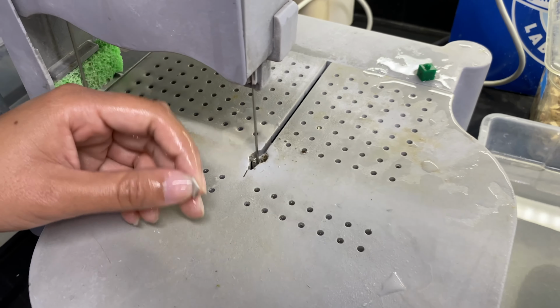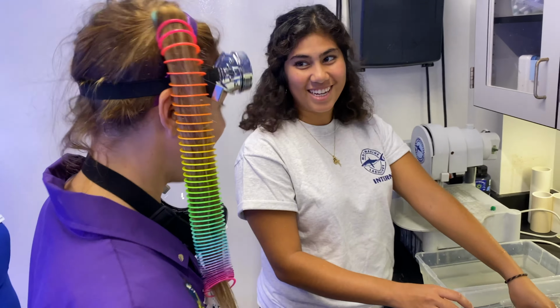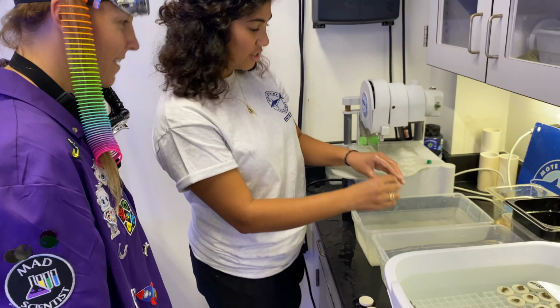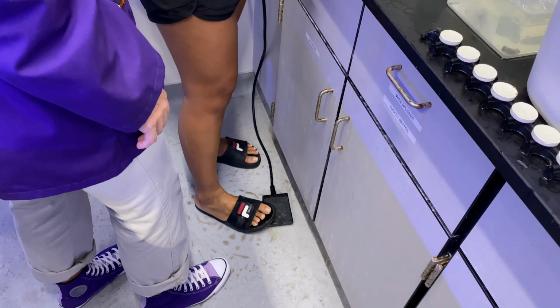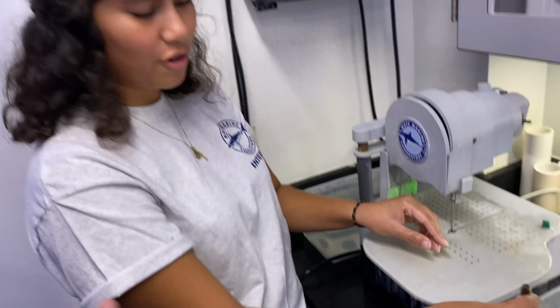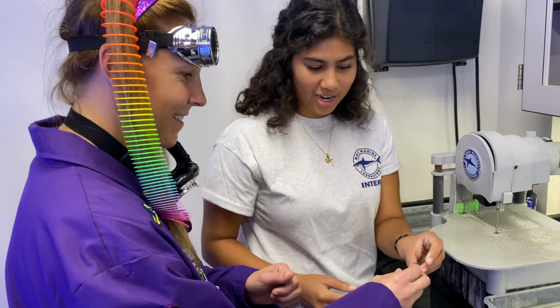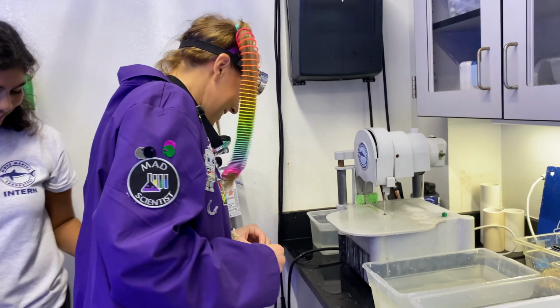Wow, you're really good at this. Thank you. How many coral have you fragmented? Oh, hundreds. Really? Hundreds, yeah. So if you want to take this one, I've already cut it in a strip for you, and you can go ahead and step on the pedal here, and you want to have 3 points of contact at all times. Okay. So at least one on each side. I like to do 4, and you'll cut it here and rock it, and then I'll rinse it and pipette it for you, and then you can cut another one, and we'll just go from there. So here you go. Are you ready? We're gonna fragment the coral together. I think you can do it.